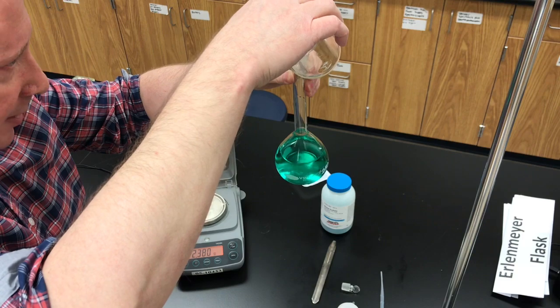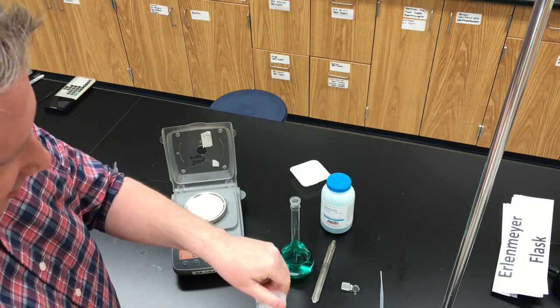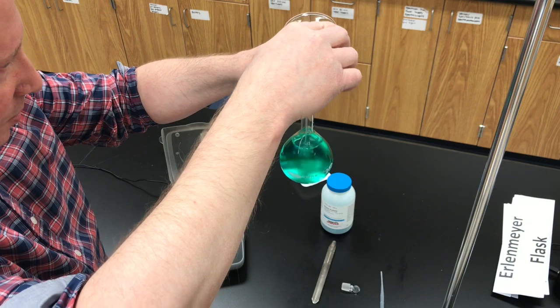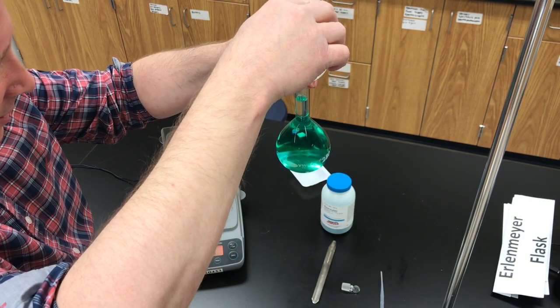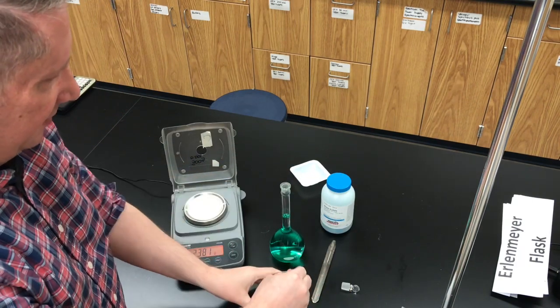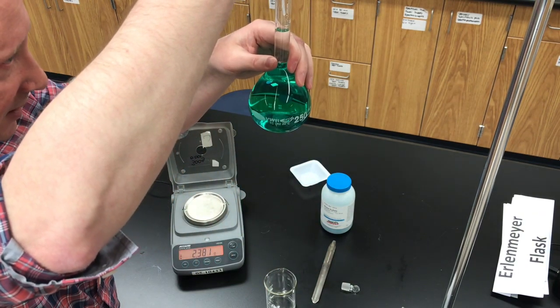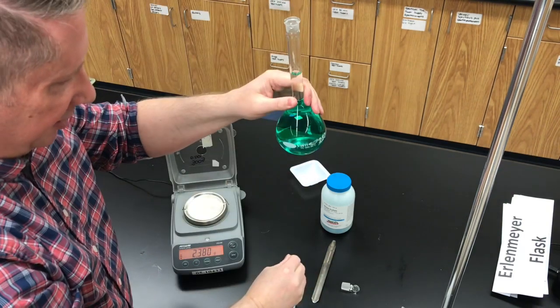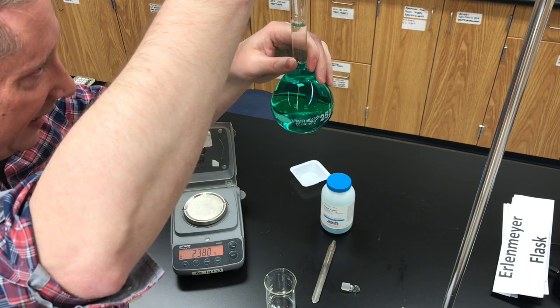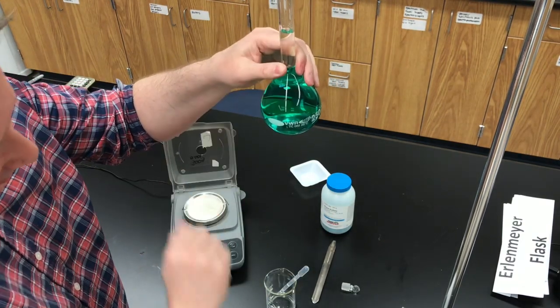Next, take a plastic pipette and suck up some distilled water from your beaker and hold the flask at eye level so you can see the meniscus — the curved surface of liquid in the flask. You'd like the bottom of the meniscus to be touching that line on the neck of the flask. Drop by drop, the bottom of the meniscus, looking at eye level, is perfectly touching the line on the neck of the flask.